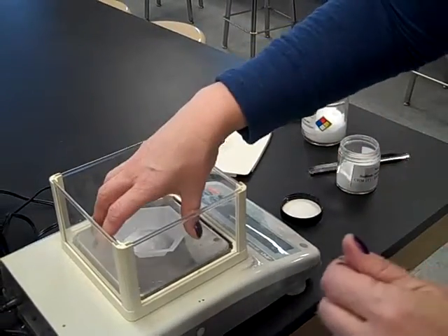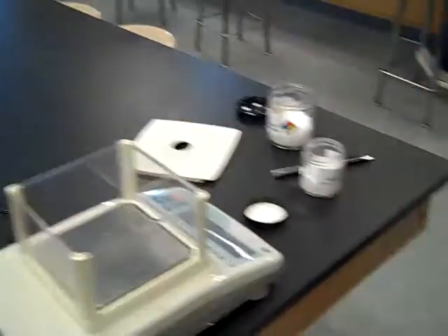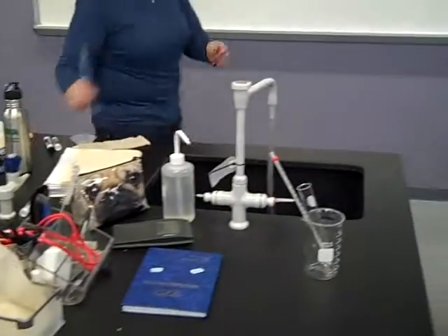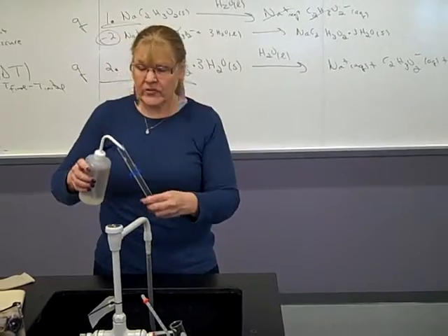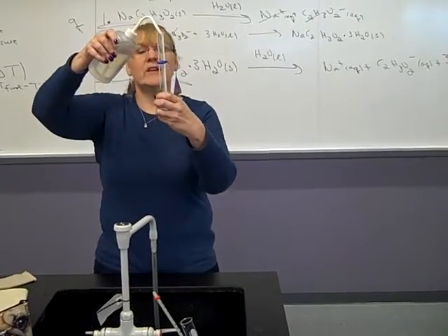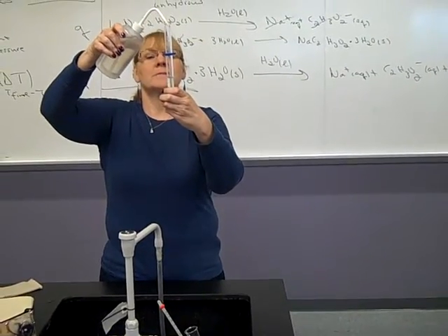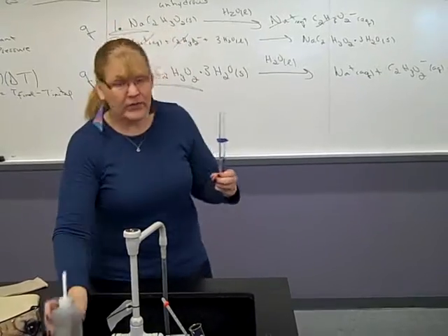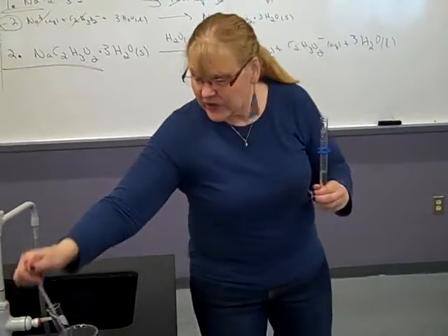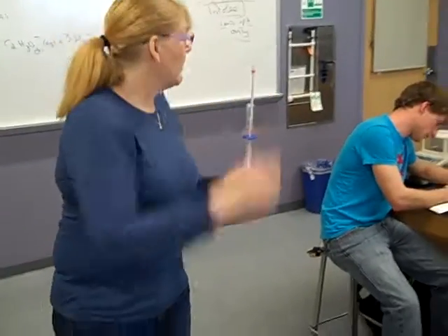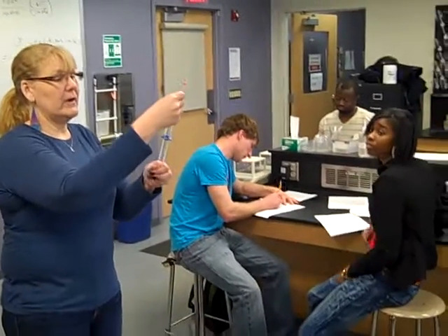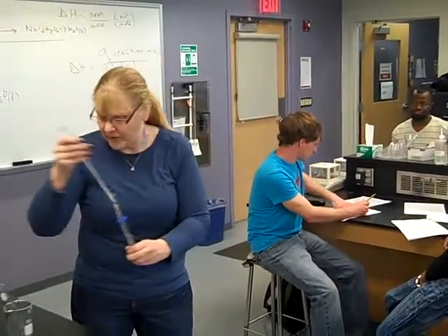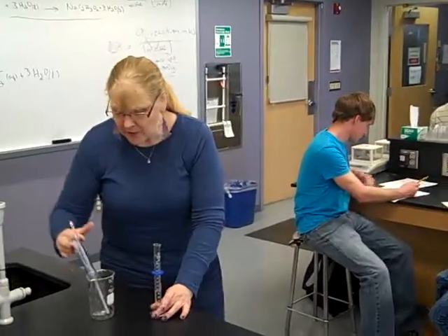So pretending I have 1.2 whatever grams, I'm going to come over here. And all I'm going to need is 10 mils of deionized water. So you get yourself some water, get a nice graduated cylinder, fill it after you cleaned it to 10 mils. When you've filled it to 10 mils, you need to know what its temperature is. So put a thermometer in it. Get the temperature. The temperature is going to be whatever this is. I got 22.0 degrees Celsius. At that point, you will do the experiment.